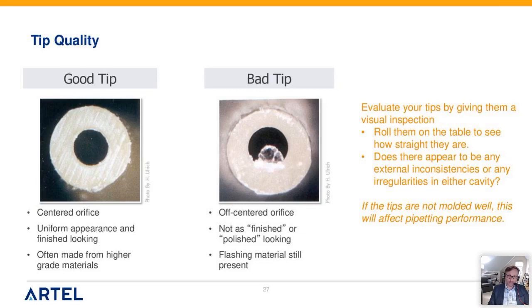If it's non-centered, if it's rough edges, these are all places that can attract liquid that you don't want. So it can either bring in extra liquid, extra volume just through the capillary action, or sometimes it can retain fluid and give an under dispense. So again, this is about fit and it's about liquid delivery.